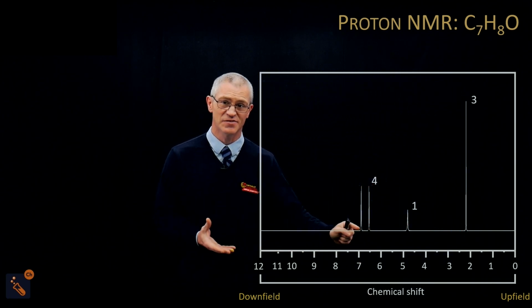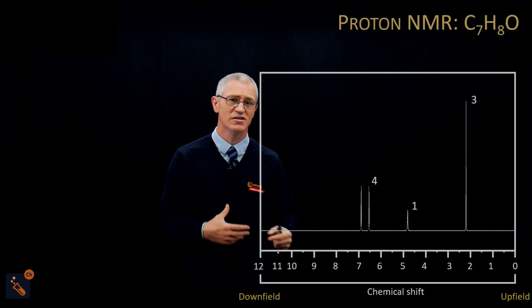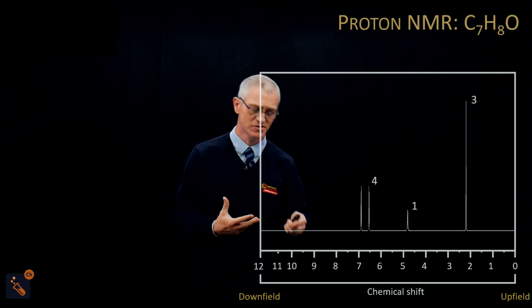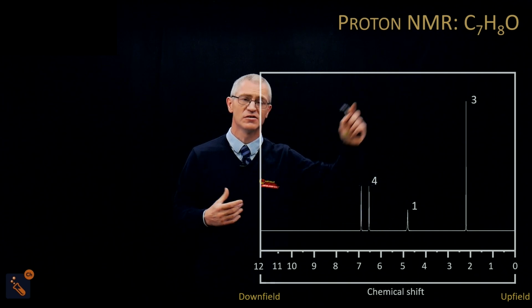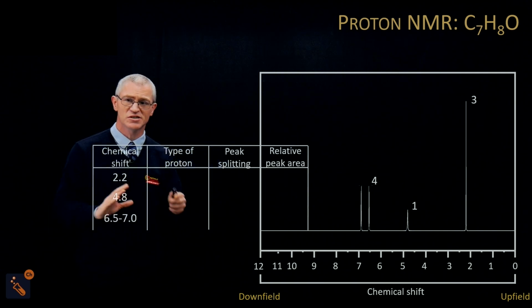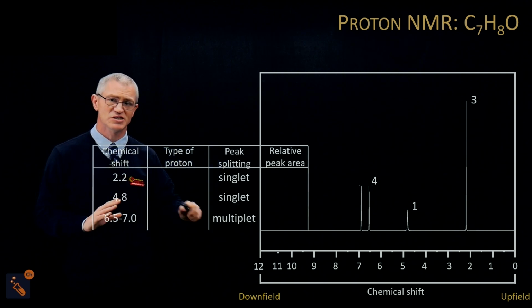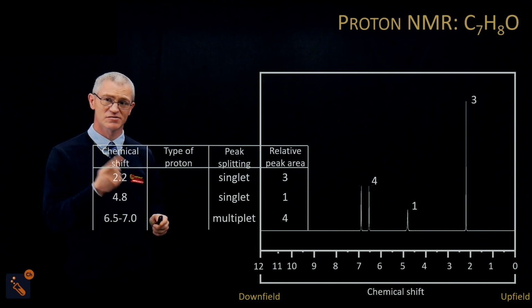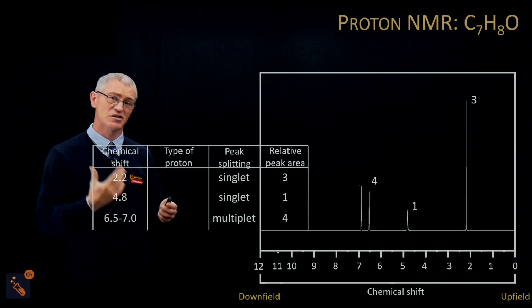And we can't see any other functional groups, nothing like an aldehyde, no carboxylic acids or anything like that. You can't see anything else. So I'm pretty sure this is an alcohol and that oxygen is used up. Here's the table, here are your chemical shifts, your peak splitting and your peak areas. As said, we think that you will have a CH3, an OH and a benzene.